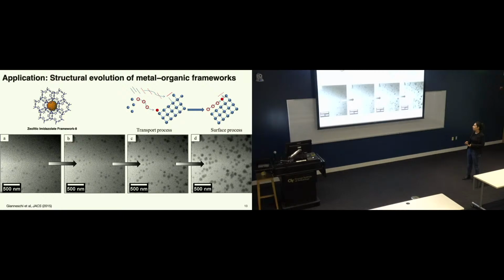There has also been work in observing in situ the formation of certain nanomaterials. This could be single nanocrystal growth, or it could be MOF materials. In this case, these are zeolite imidazolate framework 8, where you can observe in situ the formation of the MOF. And there are a lot of questions that we previously could only answer at time 0 or at the end, when the material was made, but now we can observe the whole growth process in situ, especially if this is a solution phase growth.